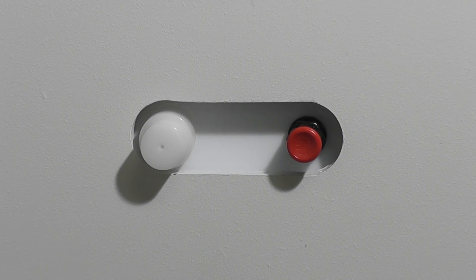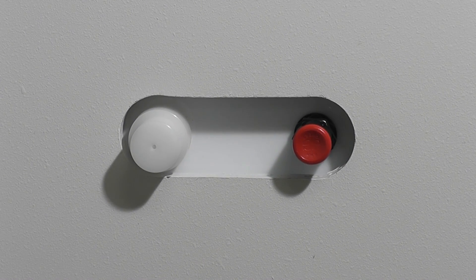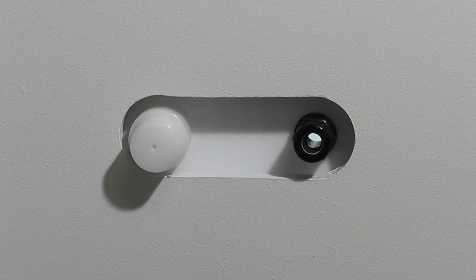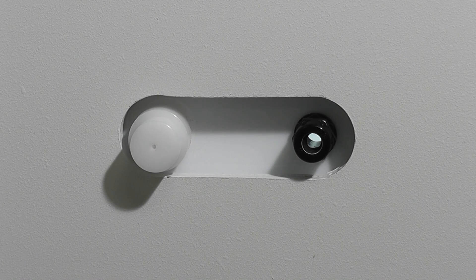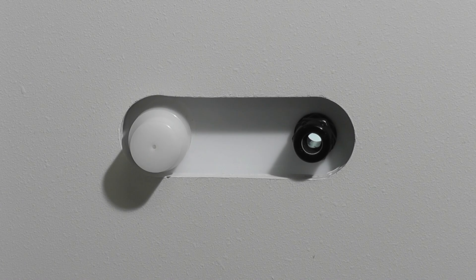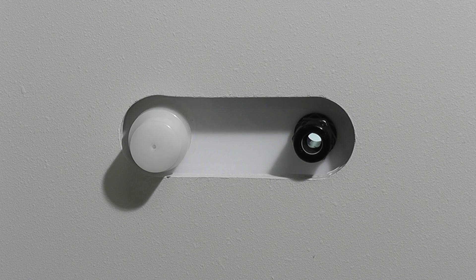The standard cable gland allows cables and probes to be introduced into the chamber without compromising internal conditions. More than one gland can be fitted. Glands to accommodate larger diameters are available.